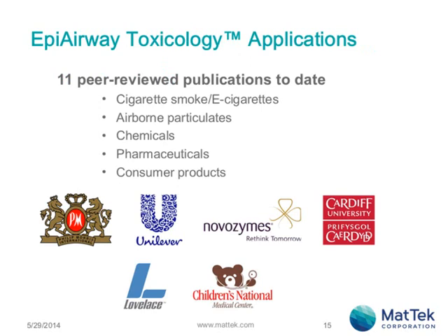Since EpiAirway is grown at the air-liquid interface, as Patrick described, it readily lends itself to toxicity studies in which the test article can be applied topically to the apical surface, which would be similar to the in vivo route of exposure through inhalation. In addition, you could also apply test articles in the basal media to replicate systemic exposure. An additional benefit is the ability to test non-water soluble substances, since for the apical application, you could dissolve your test article in non-aqueous vehicles.